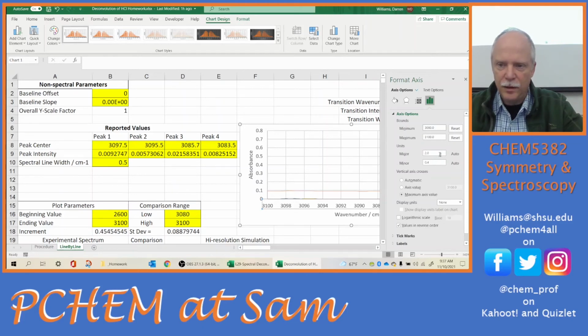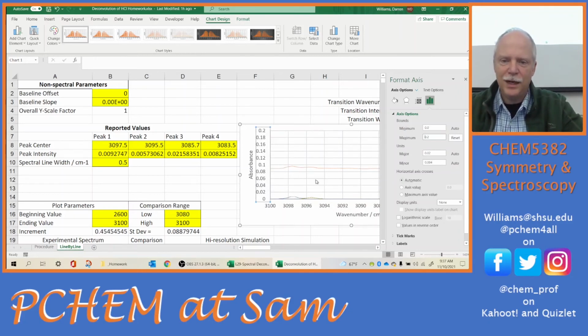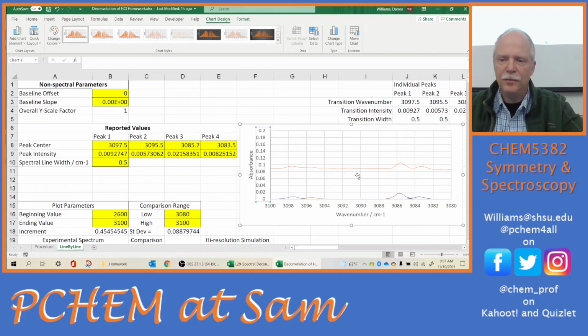Okay, and my y-axis, I only want to go to 0.2. So I want to get this where I can see my peaks, okay? And so I'm doing Murad's assignment for him here. So here's this on video. Congratulations. Okay.